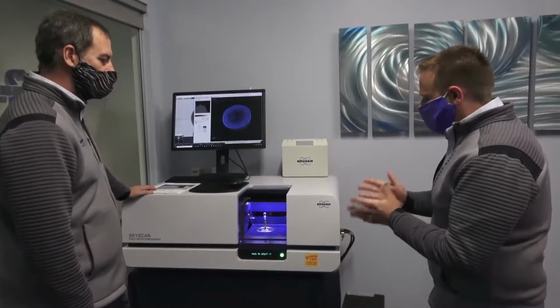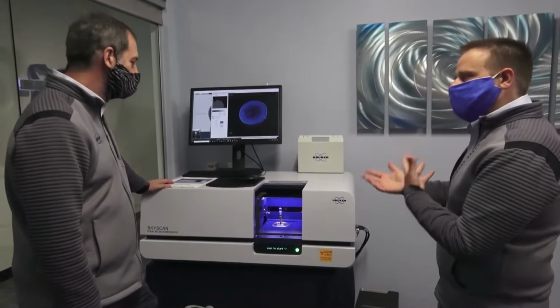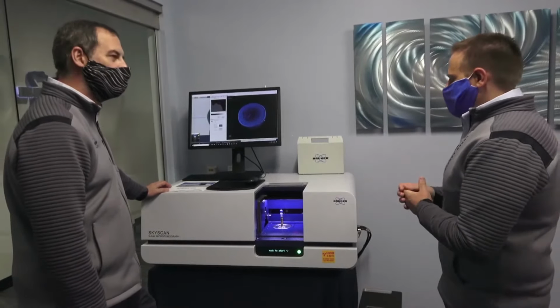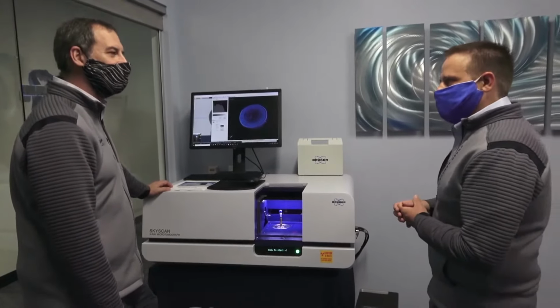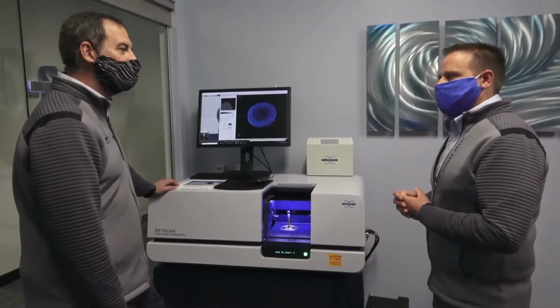Well, this looks like a really intriguing technique. Being a material scientist in the past, I was never aware that you could use X-rays like this. I knew that they had techniques in the light microscopy realm to do 3D. Right. But the sample has to be somewhat clear or visible, with lots of caveats. Exactly. But here we can actually start looking at samples that are opaque to our normal spectrum.